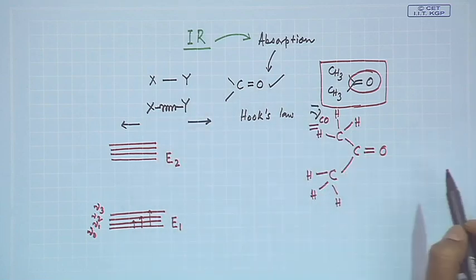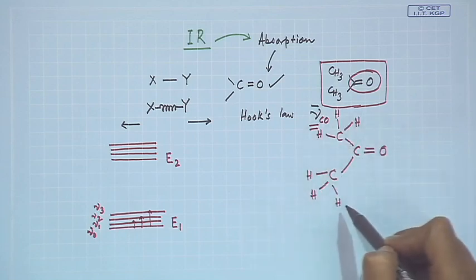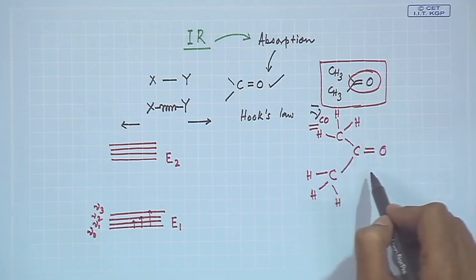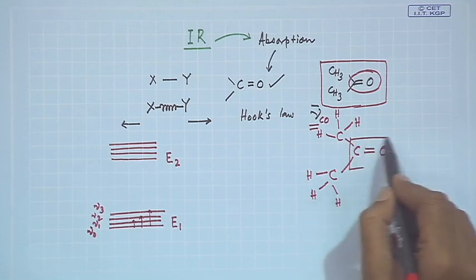These are the different XY combinations, and they will have the corresponding absorption in all these different levels. So, in this spectroscopy we will see which one will be characteristic and which we can detect very nicely to determine the identity of this particular solvent molecule having this particular functional group.